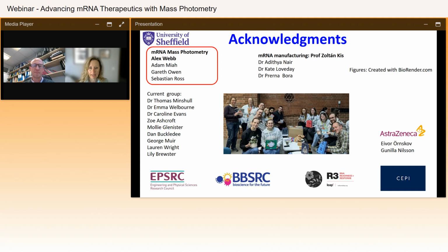Thank you. In the aggregate study, could you comment on the stability of the aggregate structures? Specifically, were the fractions measured immediately after fractionation? Okay, that's a really good question. I probably didn't have time to go into the detail during the presentation.